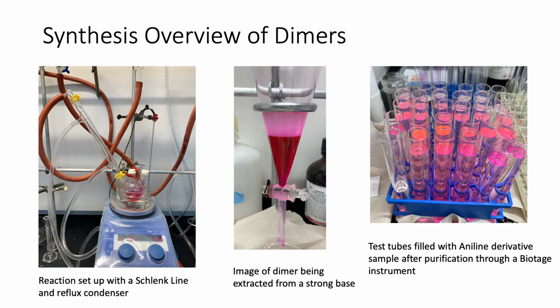which we can then analyze using TLC plates and combine to then rotovap down and take NMRs of these more purified samples to see how pure our product is.